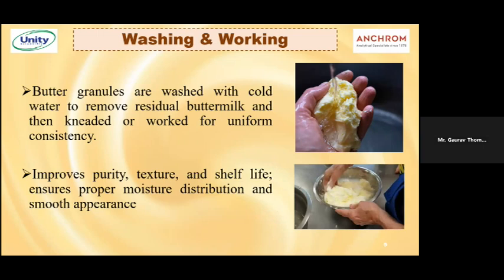Here the cold water is used for washing the fats and the lactose-containing liquid, because if you use hot water, the fat globules and other things in the semi-solid cream that is left back would get washed off, and you would lose the yield of butter at the end. So make sure cold water is used for washing.